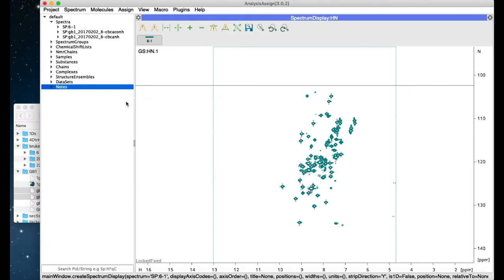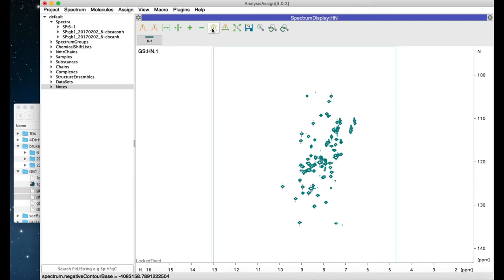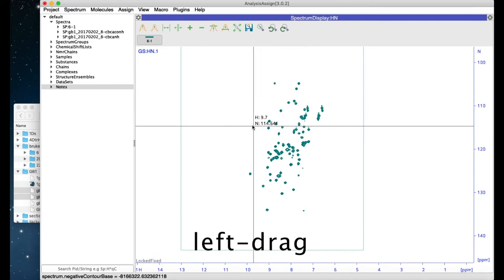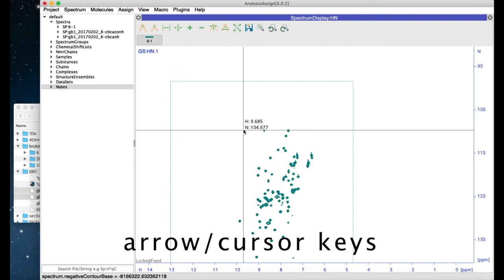When your spectrum is open, you can change the contours using the buttons on the toolbar at the top. You can move your spectrum around by dragging it with the left-hand mouse button or by using the arrow keys on your keyboard.